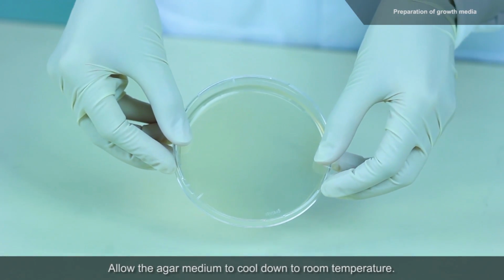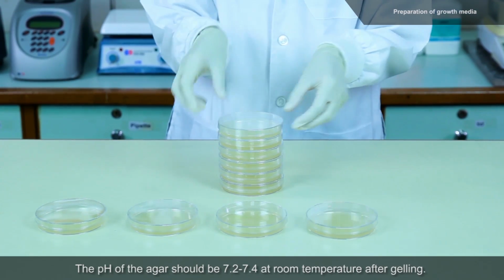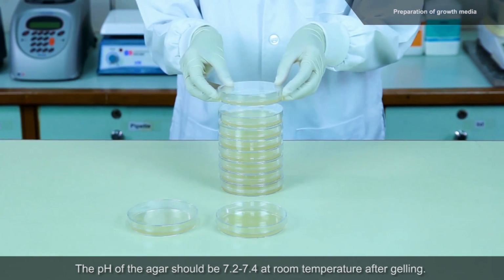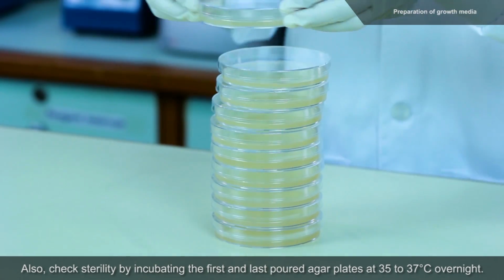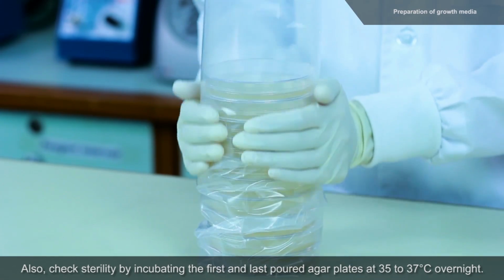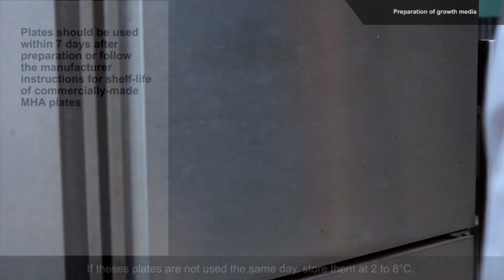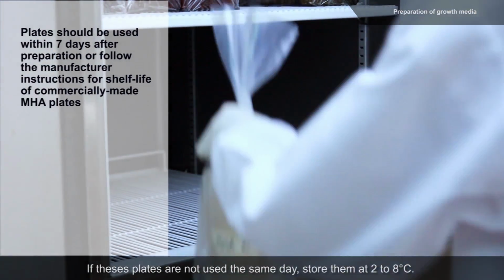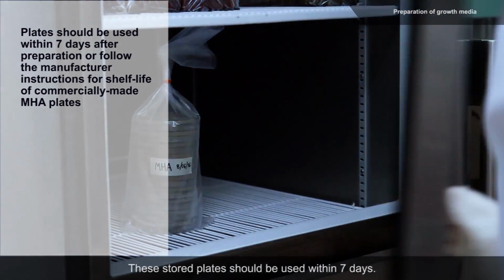Allow the agar medium to cool down to room temperature. The pH of the agar should be 7.2 to 7.4 at room temperature after gelling. Also, check sterility by incubating the first and last poured agar plates at 35 to 37 degrees Celsius overnight. If these plates are not used the same day, store them at 2 to 8 degrees Celsius. These stored plates should be used within 7 days.